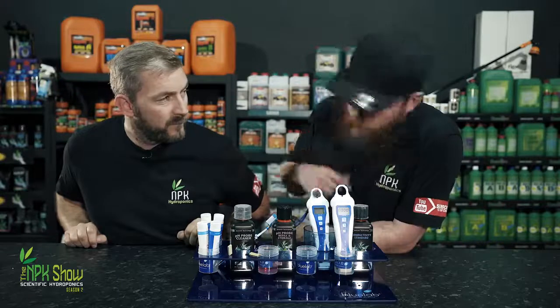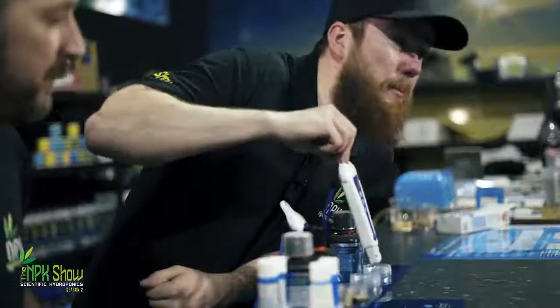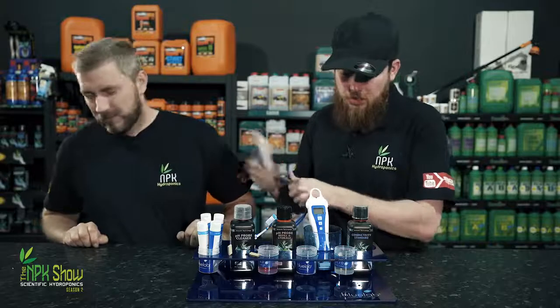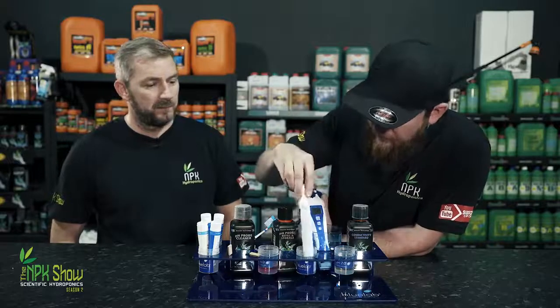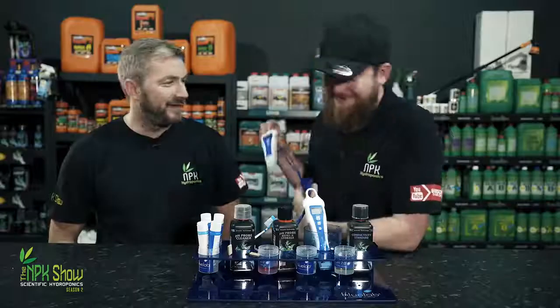You give it a little wash in some water. Once it's properly done, like I say, patience. A little wash in some water, flick it out everywhere. You best cut that out, lad. And then into 7. So once that's settled on 7, give it a little rinse. Give it a wipe. Don't be flicking it.